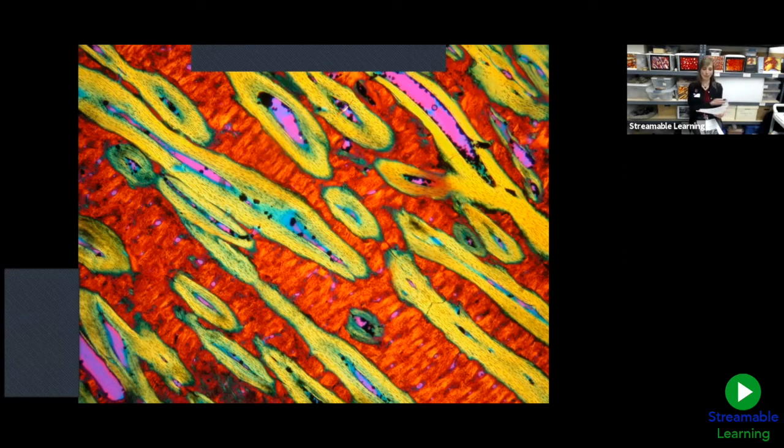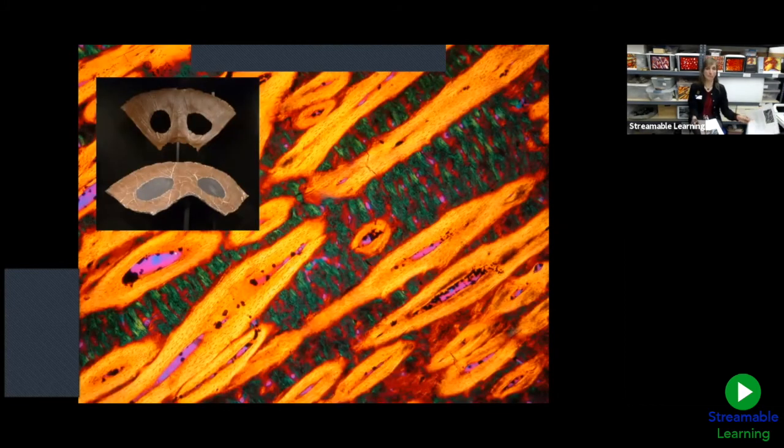Polarized light helped reveal the primary tissue layer of this parietal bone, shown in orange, as well as the extreme remodeling that was occurring, shown in yellow and green. In the case of Triceratops with a solid frill or parietal shield and Torosaurus, the one with the holes in its frill, the extreme remodeling of the bone tissue supported John's hypothesis that Torosaurus was actually a fully mature Triceratops and not a separate species.